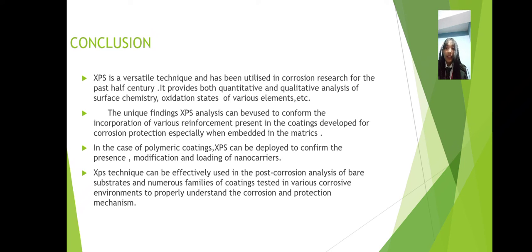The XPS technique can be effectively used in the post-corrosion analysis of bare substrates and numerous families of coatings tested in various corrosive environments to properly understand the corrosion and protection mechanism.